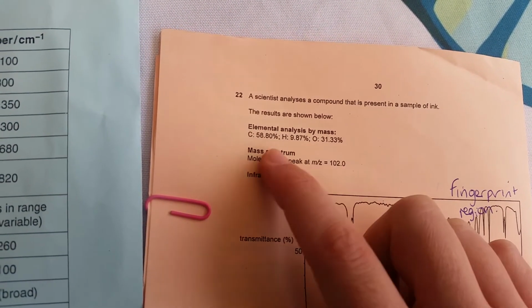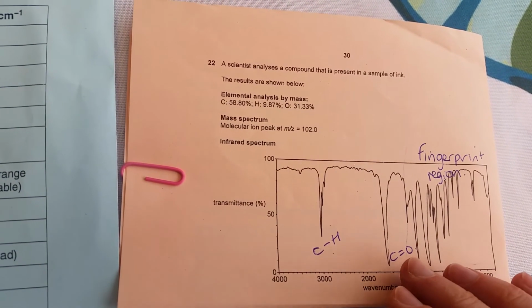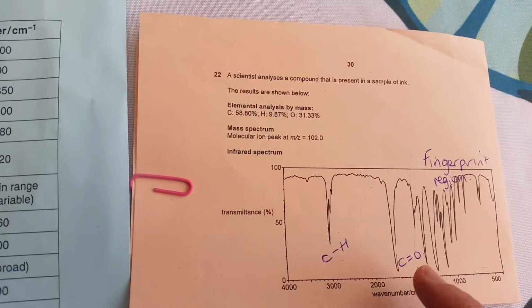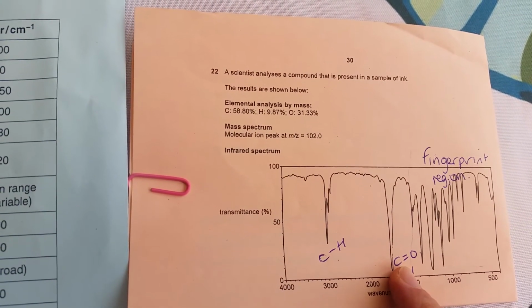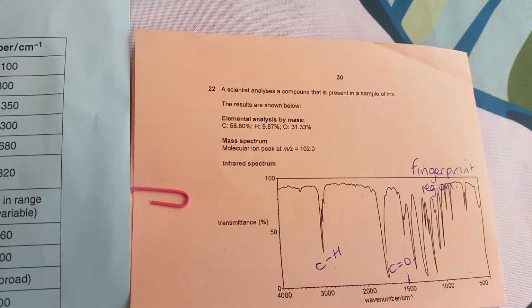Elemental analysis. So we can look here. Does what we labelled seem sensible? We've got carbon and oxygen. We've labelled it as a carbonyl. Yes. We've got carbon and hydrogen. We labelled this as CH. Yes, it does.